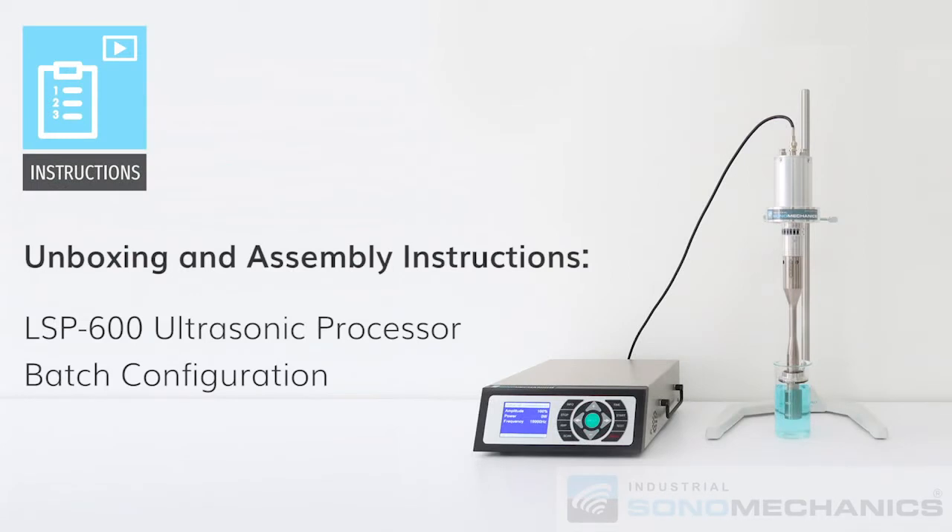Today we are going to show you how to unbox and assemble the LSP600 ultrasonic processor configured in the batch mode.